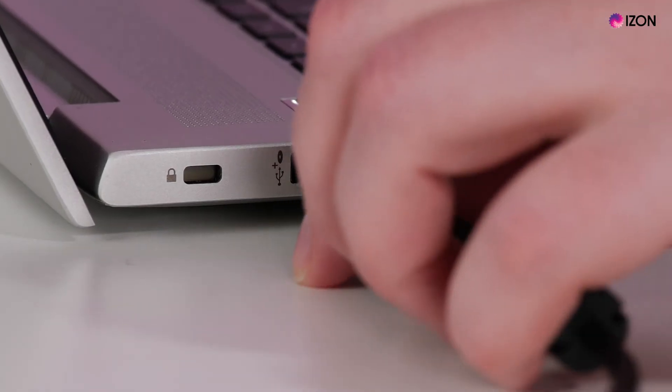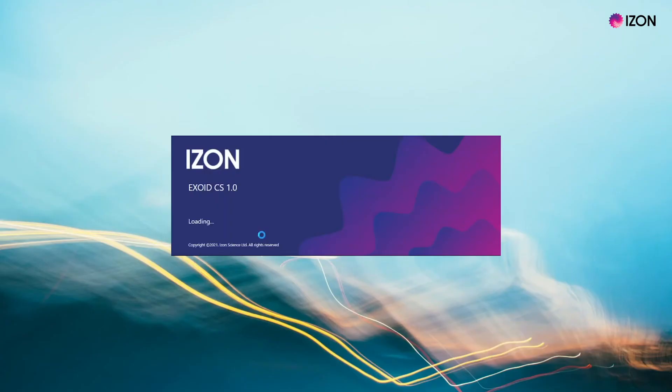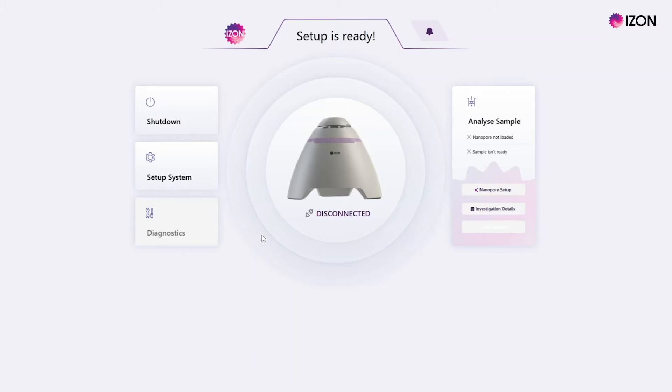Connect the USB cable to the computer with the ECS software installed and turn the power switch on the Exoid to the on position. Open the Exoid Control Suite software and wait for the instrument to connect to the software. The halo will light up and turn white when the instrument is connected.